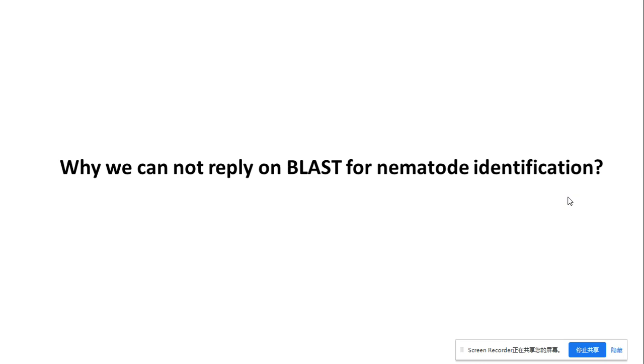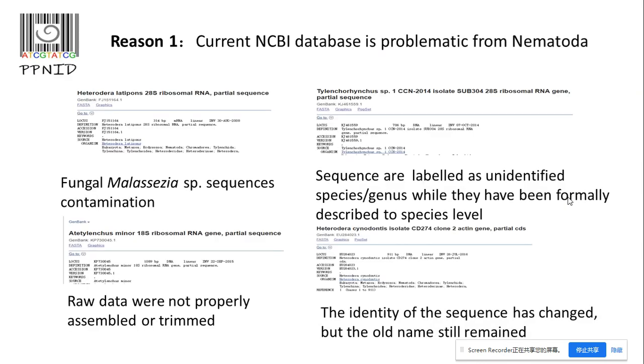But we cannot rely on BLAST. Of course, we can use it to have a brief idea, but we cannot only use BLAST for species identification of nematodes. It may work for fungi and bacteria, but it's not working for nematodes. Why? There are many reasons.